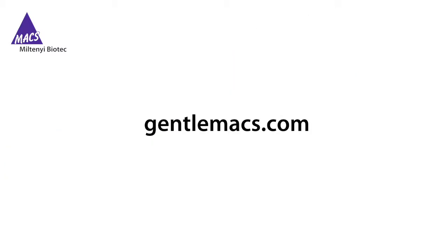That's it, very easy. For more information on the gentleMACS Dissociator and MACS sample preparation, log on to gentlemacs.com.